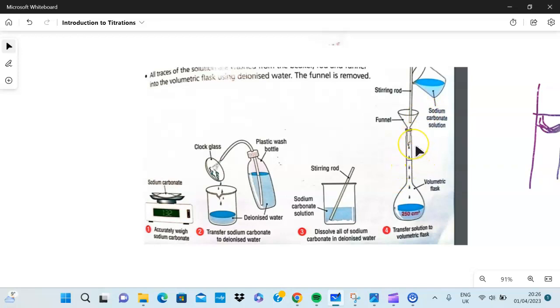The next step is not to add in more water, it's to take off the funnel. Because even the smallest drop that could be falling off the funnel could mean that you have to start over the entire experiment. Even just two drops above this line means you have to do the entire thing again. You have gone over the limit and you can't take out anything from this flask because you're losing moles of solute and reagents.